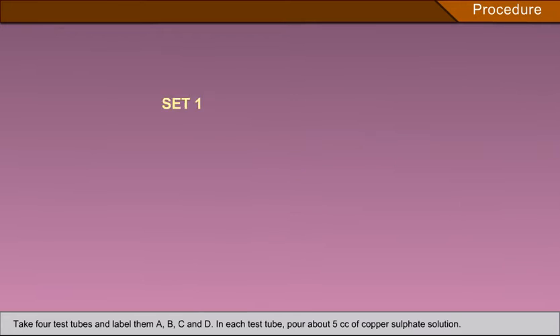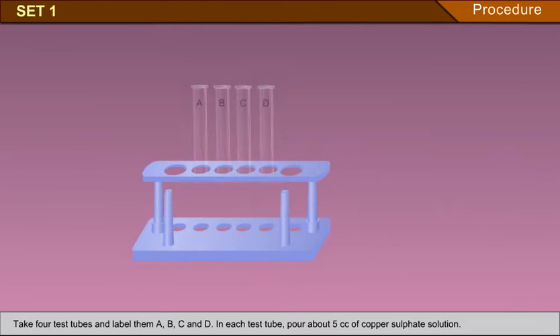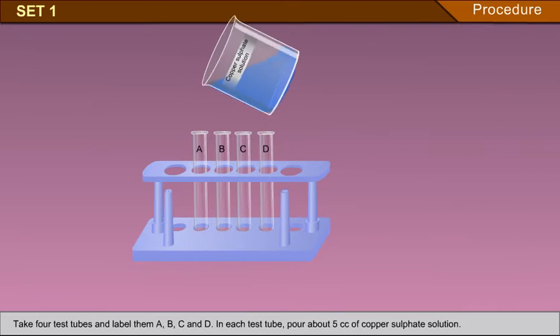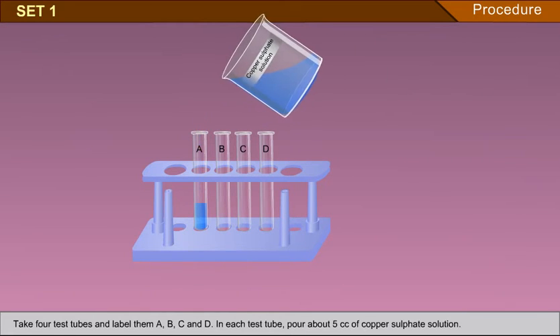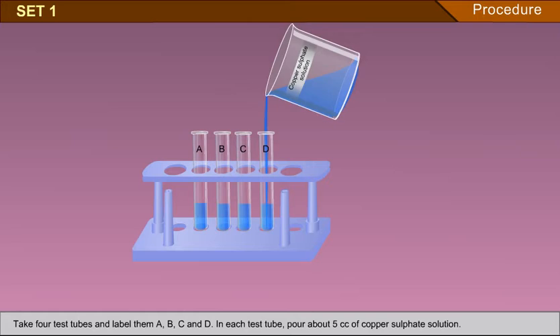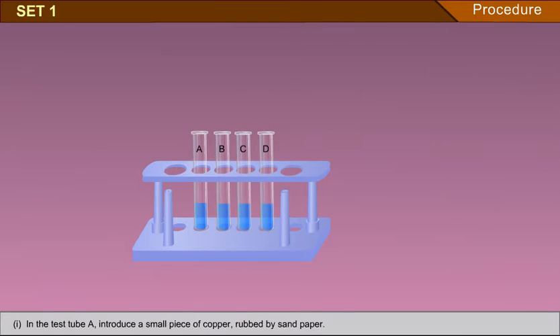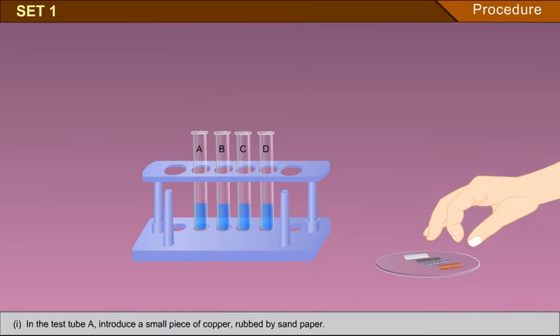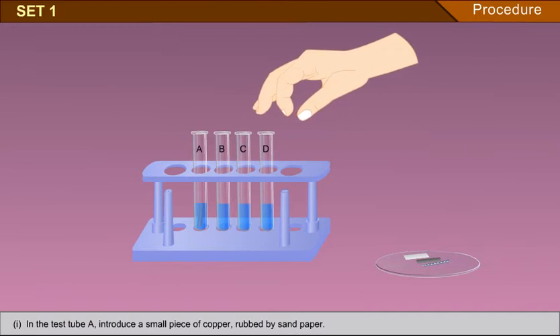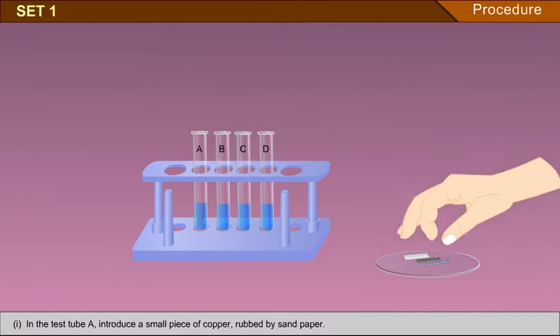Set 1: Take 4 test tubes and label them A, B, C and D. In each test tube, pour about 5 cc of copper sulphate solution. In test tube A, introduce a small piece of copper rubbed by sandpaper.